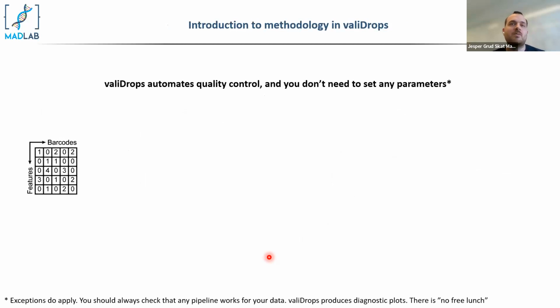And it was also starting to feel a little arbitrary where we were putting thresholds, and it was not really clear how that affected analysis. So we wanted to build this tool that could automate the process for us, to take it out of our hands and to attempt to do it also in a more unbiased way.